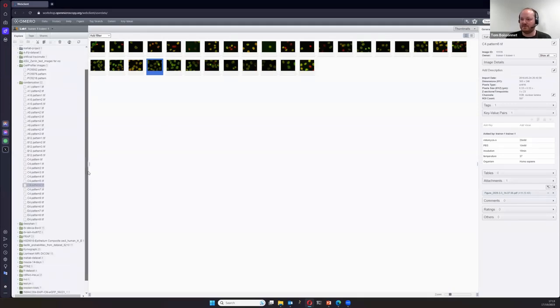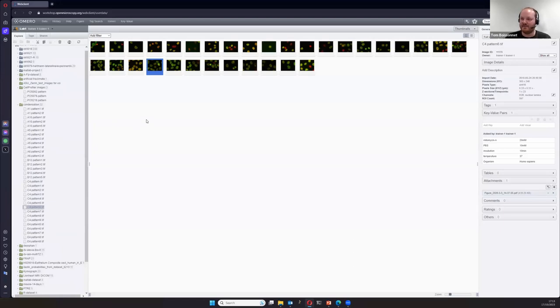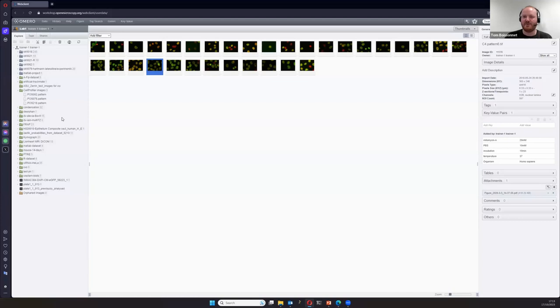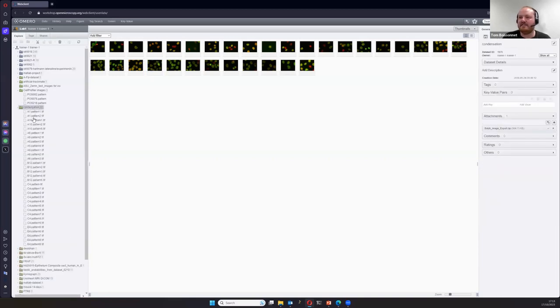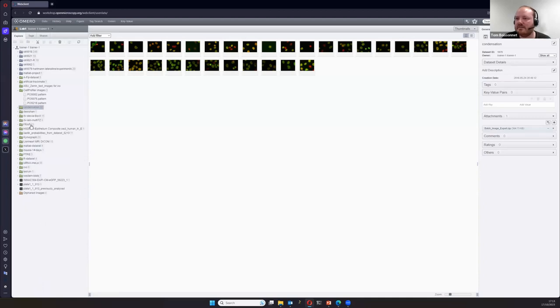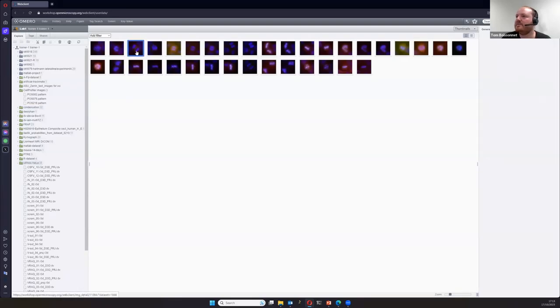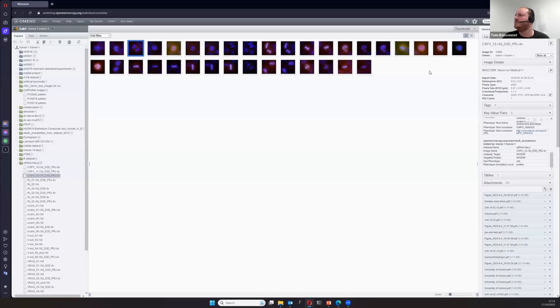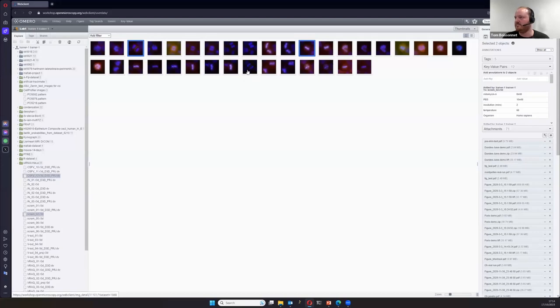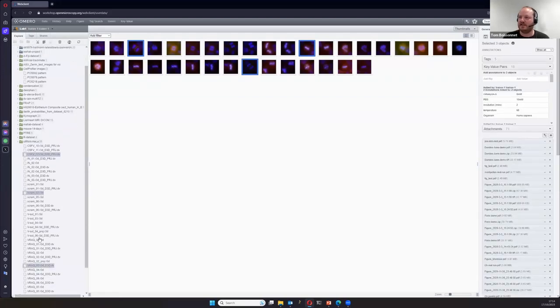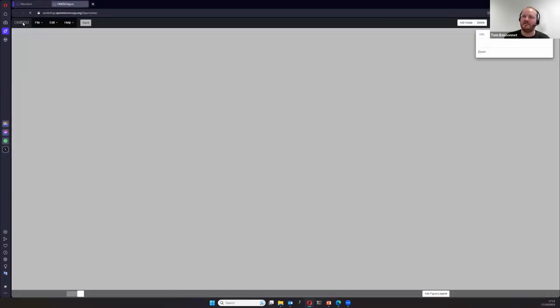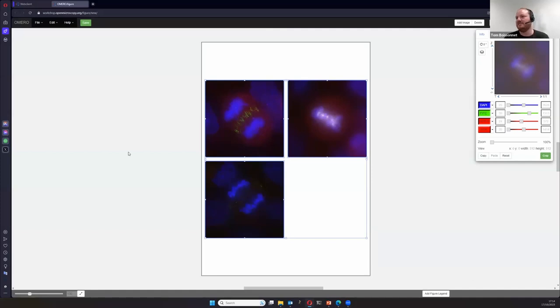We're not here to show that part but rather how to create figures. Before I give you server access, I want to give you a quick figure-creation example. I'm going to select a dataset and some images — let's go with these three. Selecting them, I'll right-click and go to 'Open with OMERO Figure.' This will open the OMERO Figure plugin for making figures and display those images inside a canvas.